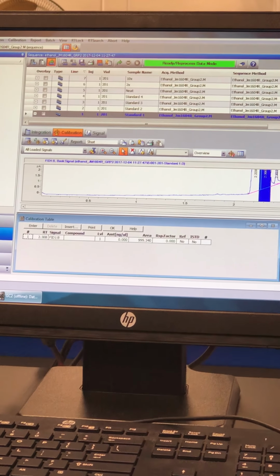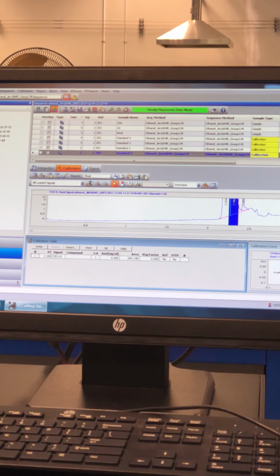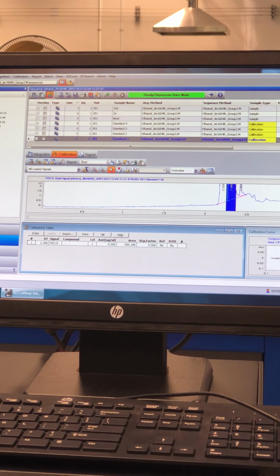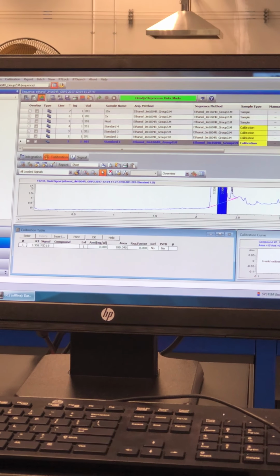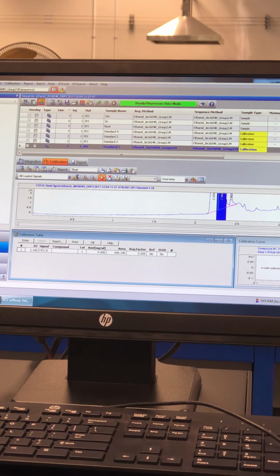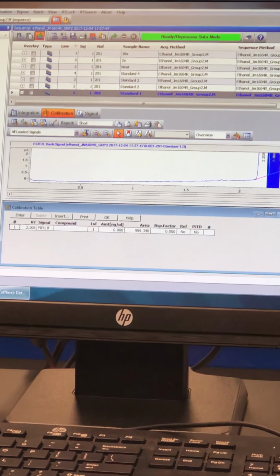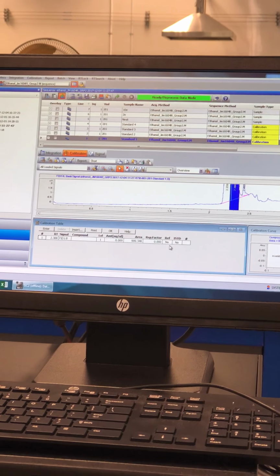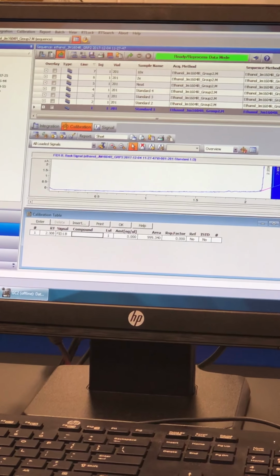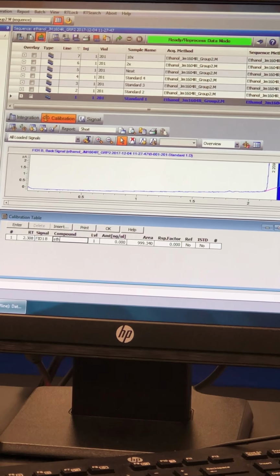If you want to delete, just bring your cursor. Yours no need, because only one. After you have deleted and identified only that row, that row of retention time is your target compound retention time. There's this column called compound. Can you please key in the compound name that you are trying to find? What is the compound name? Ethanol, right? Okay, so key in ethanol.